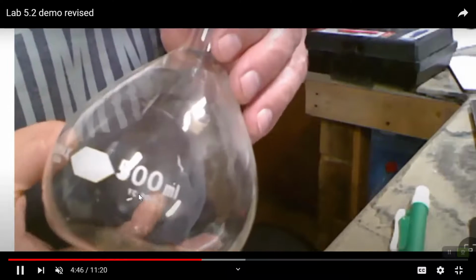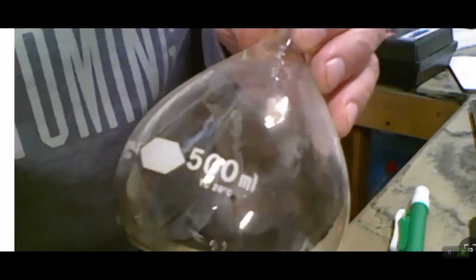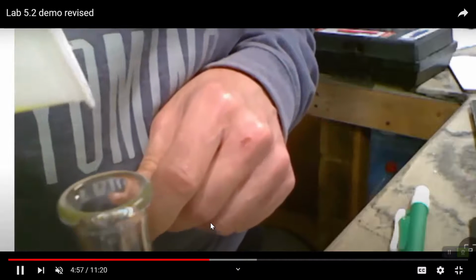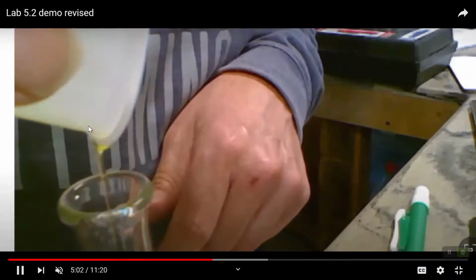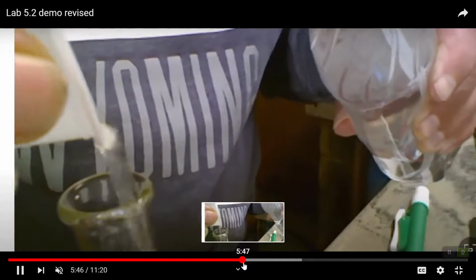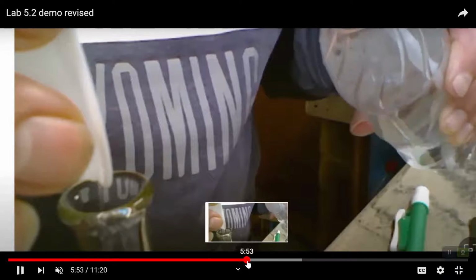And in order to get it in there, we're going to kind of crimp the edge of the cup to pour it in, and we'll pour as much as we can into there. And then we'll use a water bottle, and by spraying some water into the cup, we will get the rest of the soap out, because we want to get all the soap out of there that we possibly can. And here's where I'm spraying it to try to get the soap out of the cup. And we get all of the soap out of the cup.